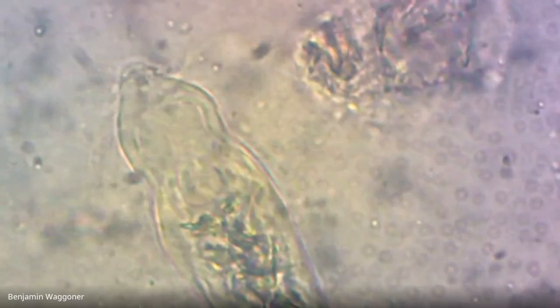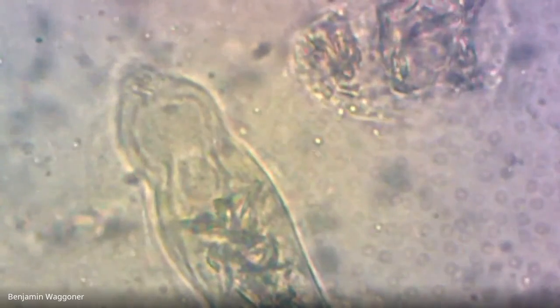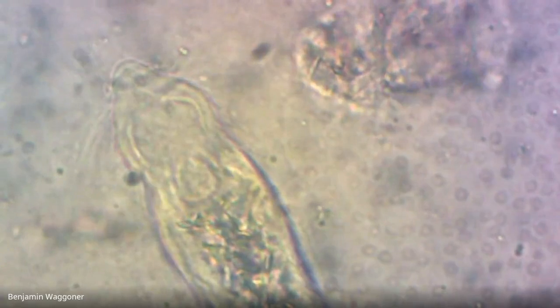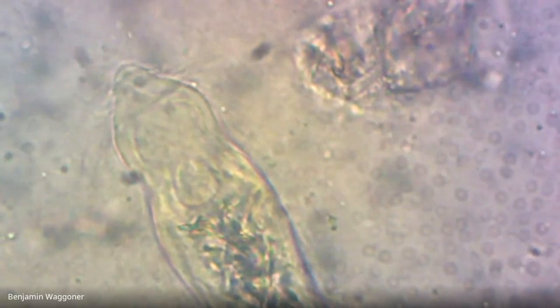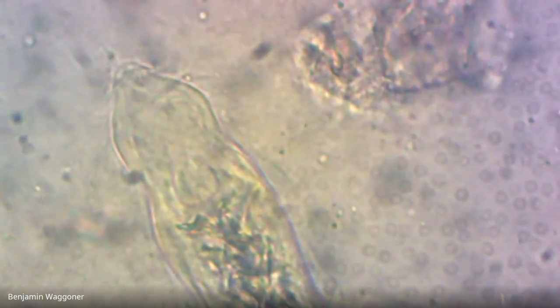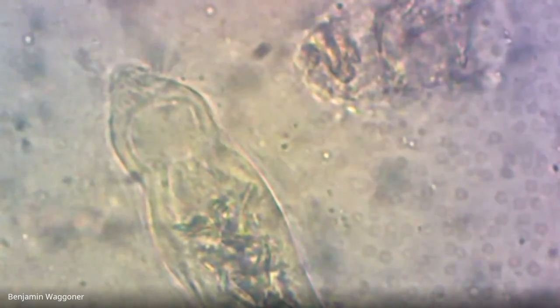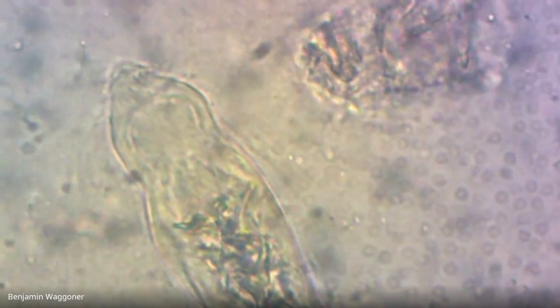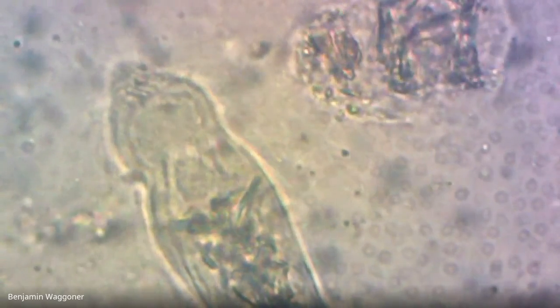It's not the same as the apical complex of an apicomplexan, but the anterior ends right there, and then sticking out all around it, you have lots of long flagella. This thing's got a hairdo kind of like I do at the moment. Lots of long flagella kind of coming out of that cone-shaped head and radiating out all around the body.